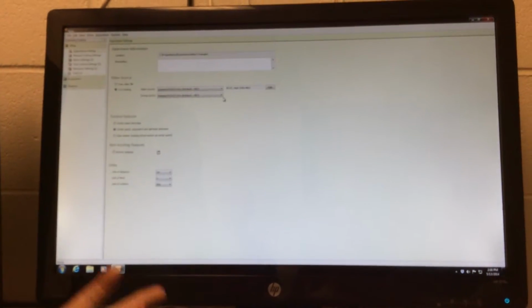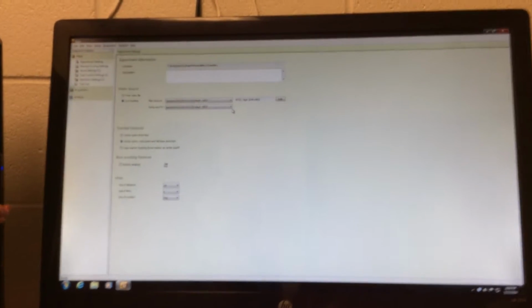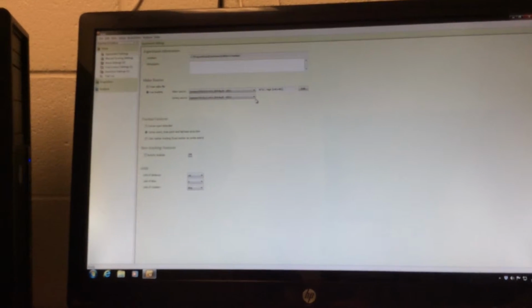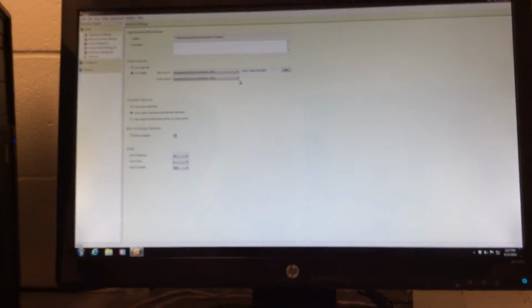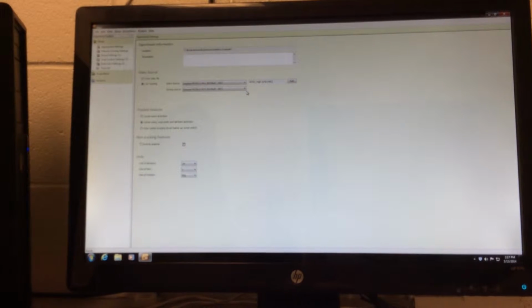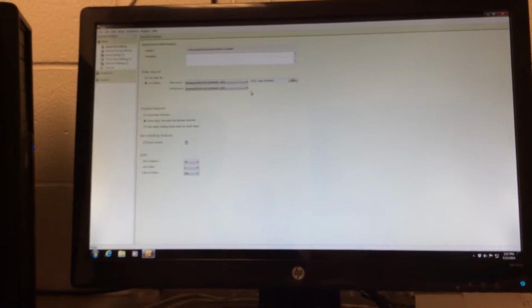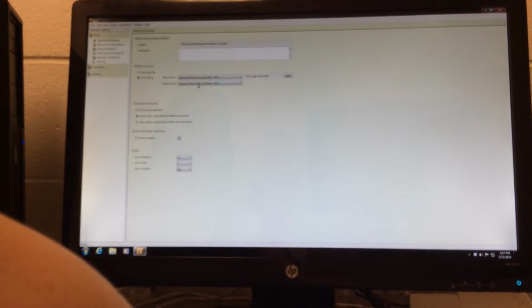And the reasoning is that if you're acquiring, let's say 20 tracks for 20 different animals for one experiment, you want all the settings to be the same throughout, right? You don't want it to suddenly change, because then the data you tracked at the beginning might not match what's at the end. You want it to be as automated and consistent as possible. So we've left it that way: once you start, you can't change it. But yeah, so the only way to do it is to start a new file, or a new experiment.